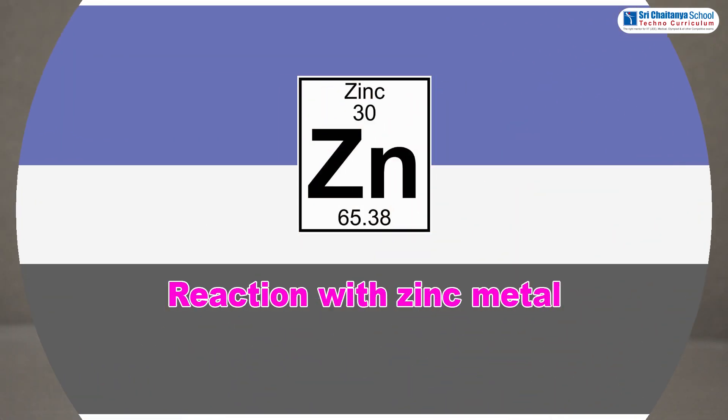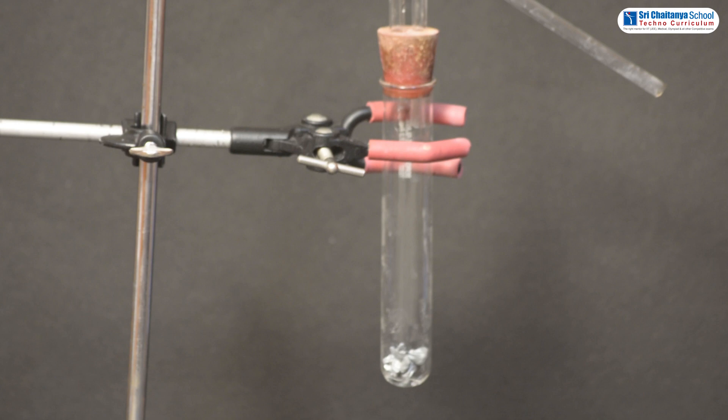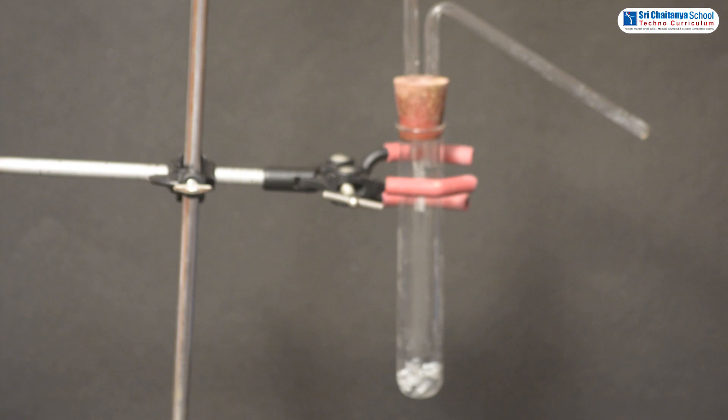Now we will do reaction with zinc metal. Take a few pieces of zinc in a boiling tube. Now add sufficient amount of NaOH solution to the boiling tube.